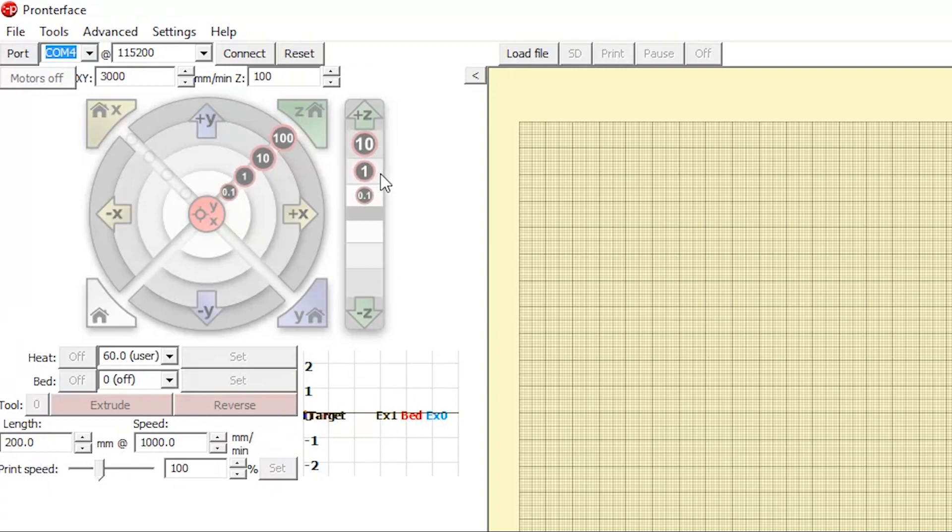So clicking plus Z will move the bed down, increasing the distance between the needle of your syringe and the bed of the printer, and clicking minus Z will move the bed up.